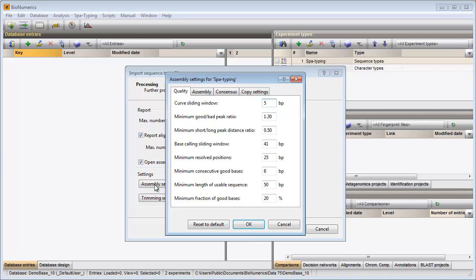Pressing the assembly settings button allows me to change the assembly settings for the spa typing experiment. I will use the default suggested settings so I can press cancel to close the dialog.